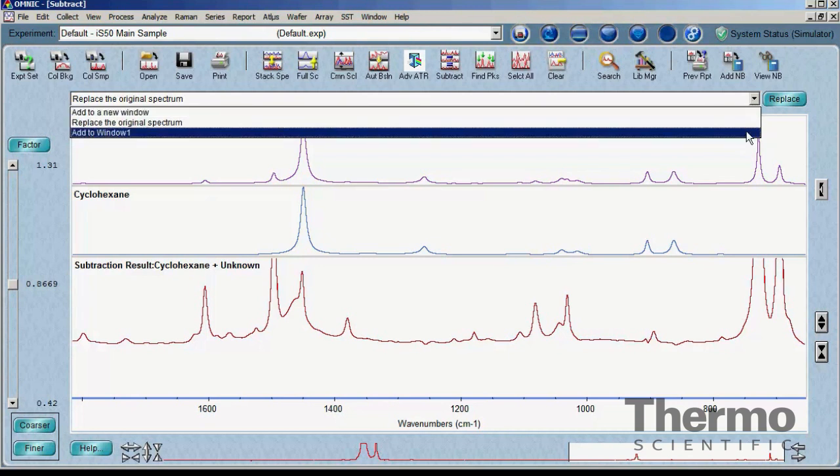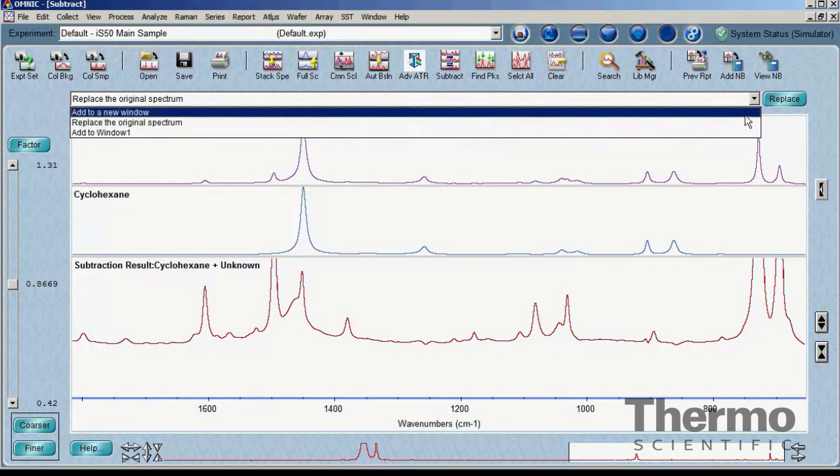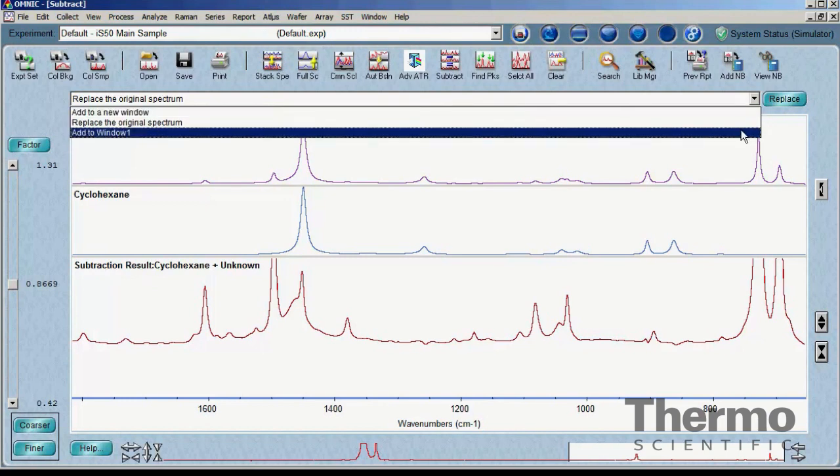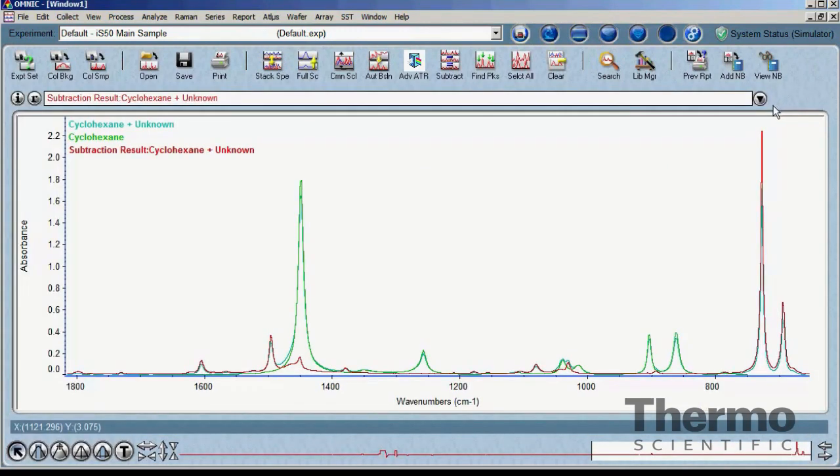The subtraction result can be placed back into the window that has the original spectrum, any other open Omnic window, or a new Omnic window by making the correct selection on the list. The subtraction result can now be further reviewed or searched to identify the second component in the mixture. If it appears that there is still more than one component in the result, additional subtractions can be attempted using different reference spectra.